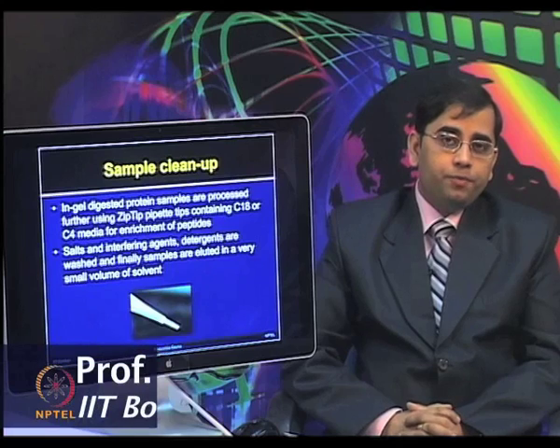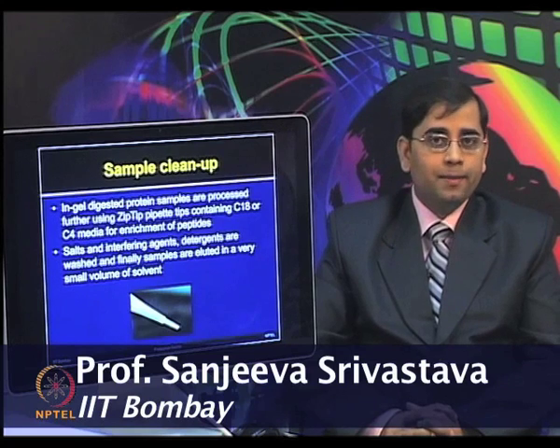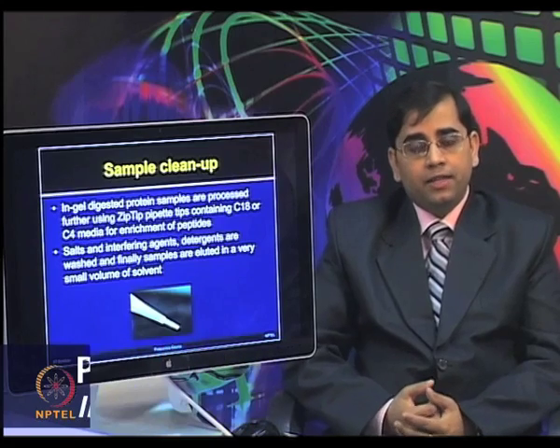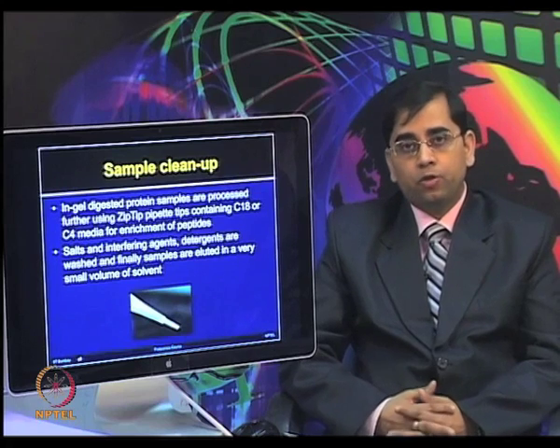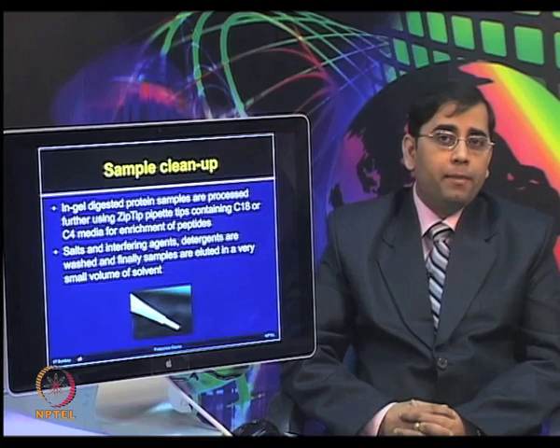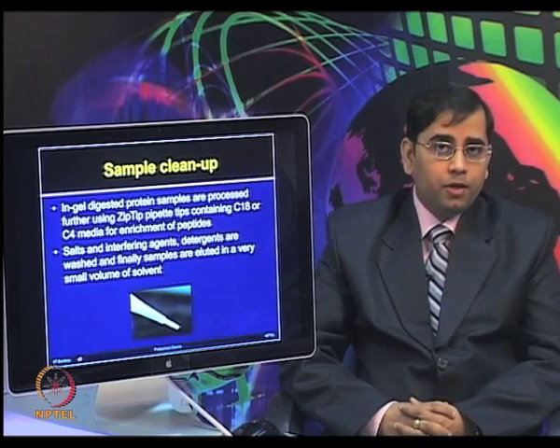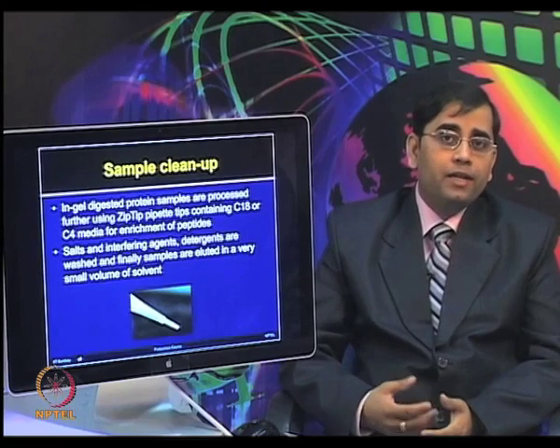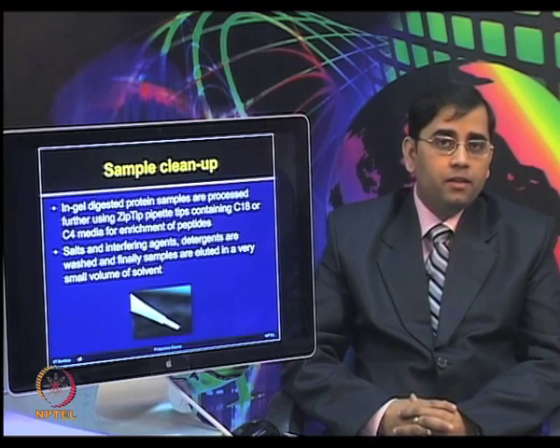So, after watching this video, now you are very clear about the in-gel digestion process, and how various steps are important to perform these experiments. Now, once you have done the in-gel digestion, you can directly use this tryptic digest for further mass spectrometry analysis, but it is often recommended that in between you add one more step, which is sample cleanup. You do not want your columns or your MALDI instrument to get clogged due to the salt or some other interfering residues present in the mixture.